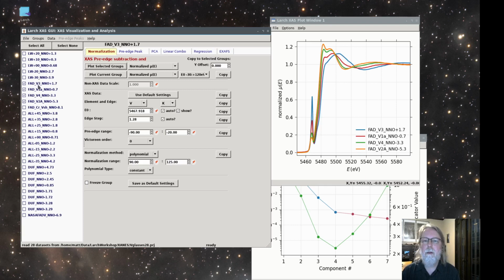But since it's quantifiable, we might also just ask if we can get that directly from the spectra and not have to first get the oxidation state and then work out the fugacity from that, because there might be other variables involved. In fact, these spectra are all a little different, so there might be other factors involved, characteristics of the sample that affect the XANES spectra, but really encode the fugacity.